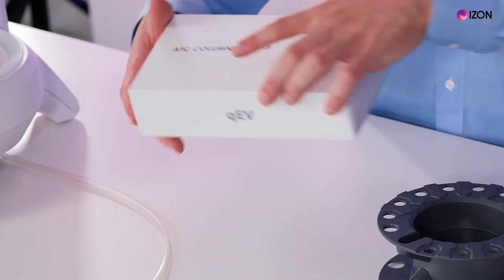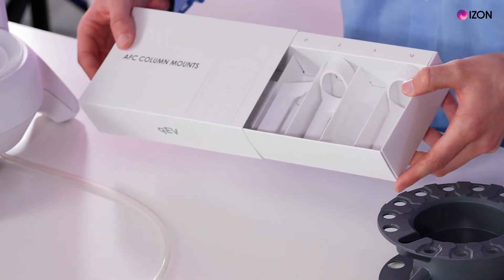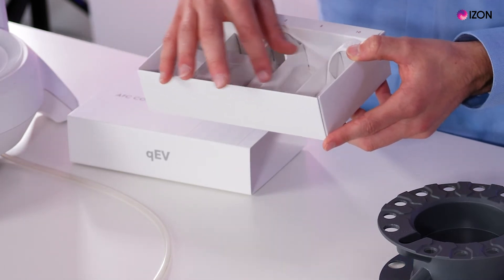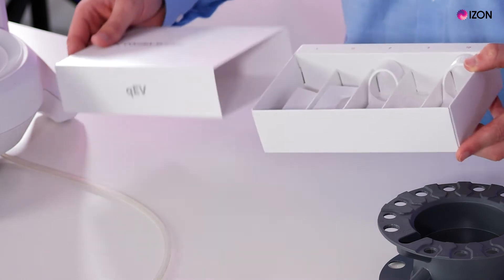We have the AFC column mounts — these are for the QEVs. We have four different types: singles, originals, twos, and tens, and we have a reservoir for the original column.